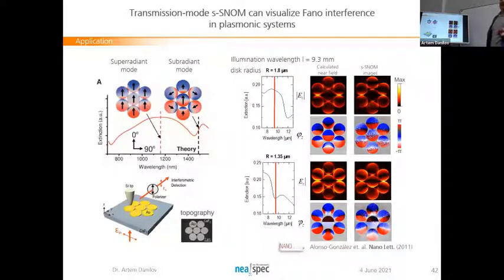Yeah, okay, but still you need quite a few degrees of freedom to distinguish the normal and in-plane components of the electric field with those phases. So it's fixed quantities. How do you detect them? Or what kind of filters? You can put filters, yeah. Or what kind of filters do you need? Yeah, to distinguish between different orientations.